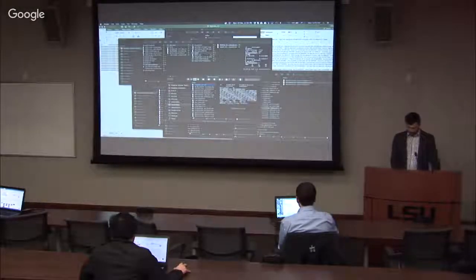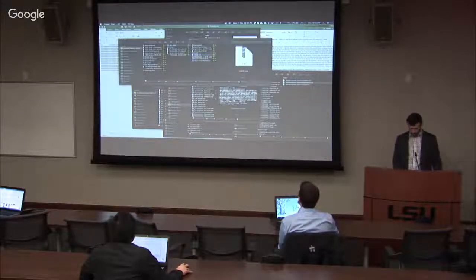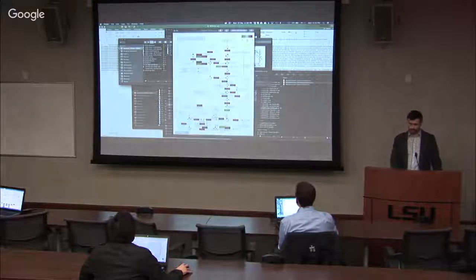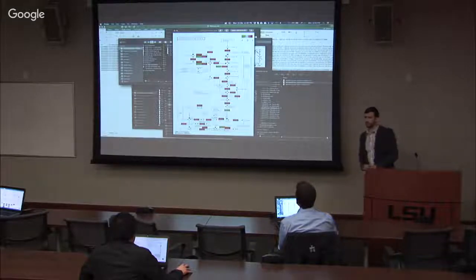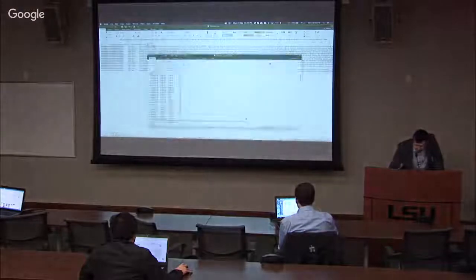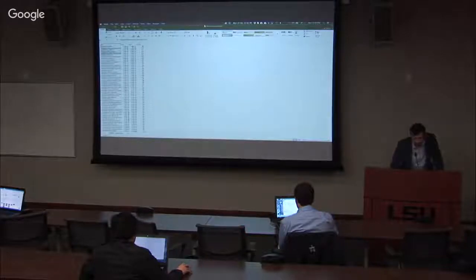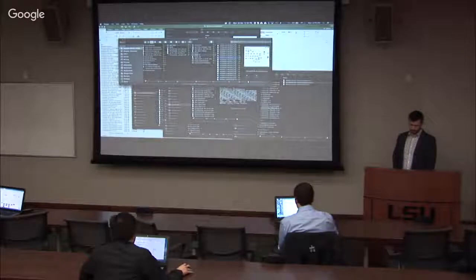And since we don't have time to look at the output from GAGE, I included here the zip file, and that is the result from GAGE. So if you unzip that, you will see the pathways, and then you can see based on fold change what is up and down regulated. You also have here a text file, which is going to list out the pathways. So you can see that the gene sets are pathways, and then you have the p value and the q value and the set size. So you will find those images inside and the data in that table.